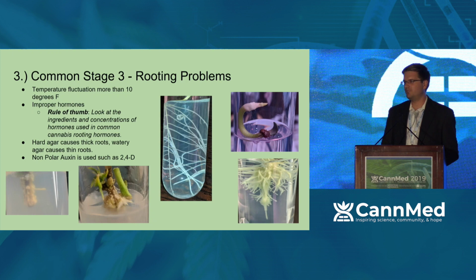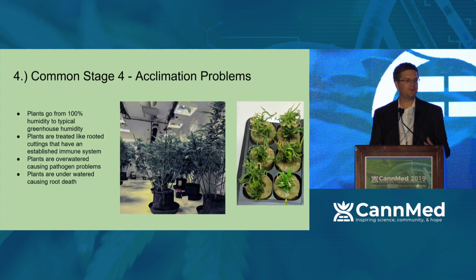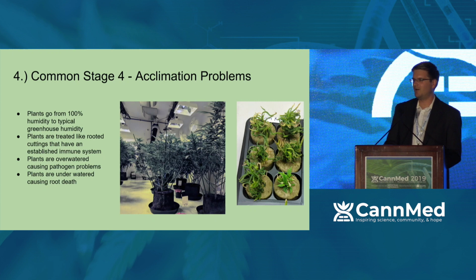The last one that I really have noticed is stage four problems or acclimation problems, where the grower will actually pull their plant out of the test tube and just expect, well, it has shoots and it has roots, why can't I treat it like a cutting? Well, these things have been under 100% humidity. There's no reason that you should expect to treat that like a cutting. You have to harden it off like a cutting. Treat it like a non-rooted cutting maybe, but not one that you can just plop out of a tube and stick straight in a greenhouse.